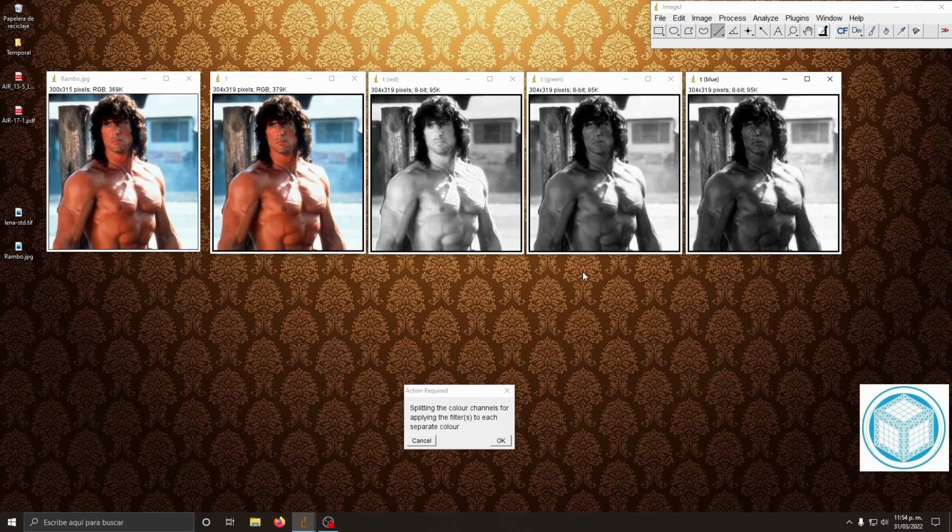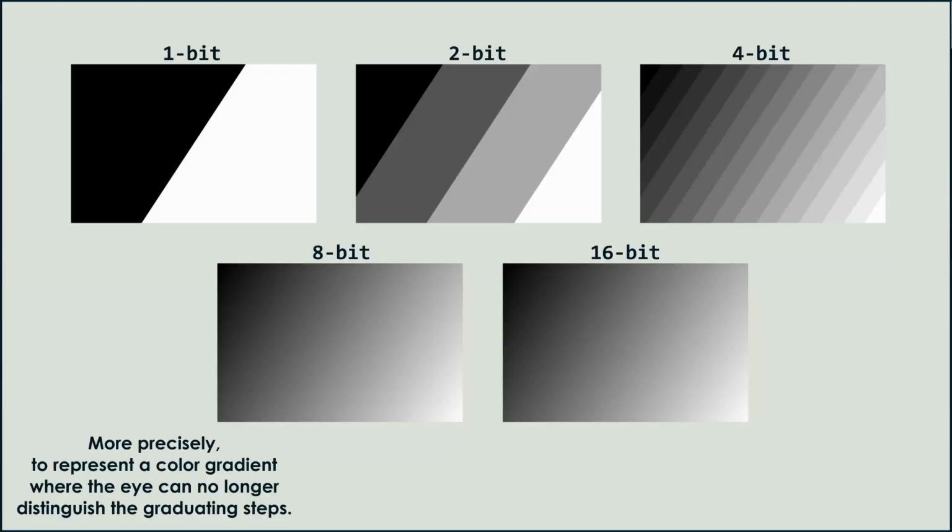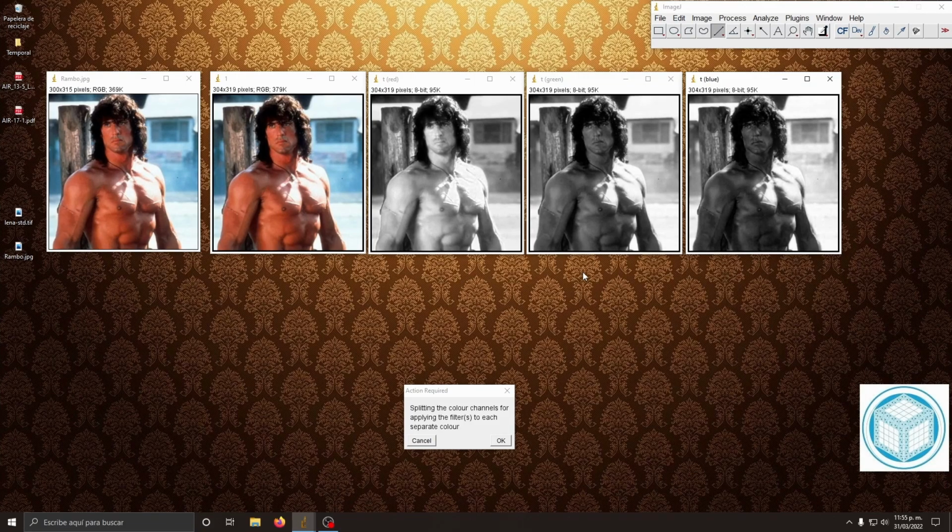Actually, the Laplacian filter has a -4. That's the source of the negative values. But wait, that's not possible. Images normally have pixel values that range between 0 and 255. Well, this is because we usually work with 8-bit depth images, which is more than enough to represent all visible colors. But 32-bit floating point images can actually have negative valued pixels and a really much pixel depth.